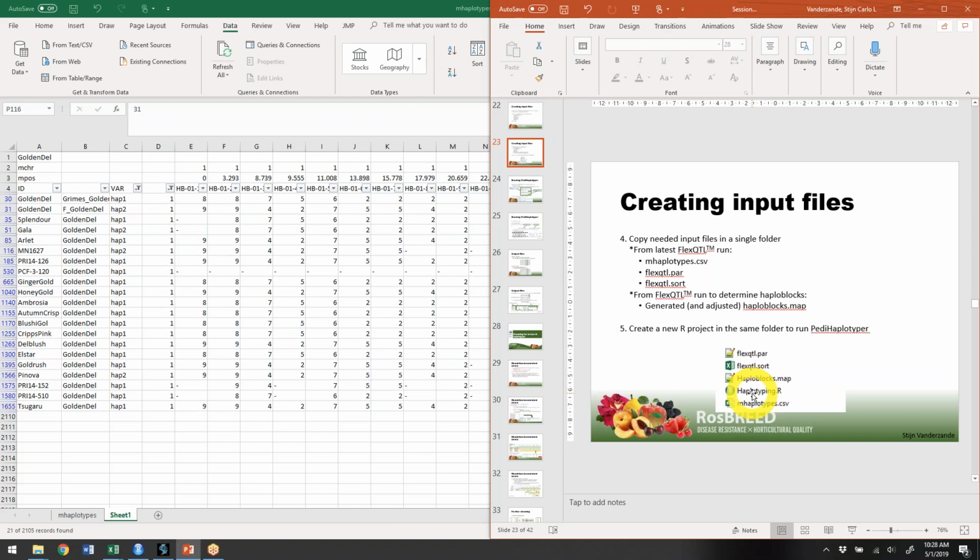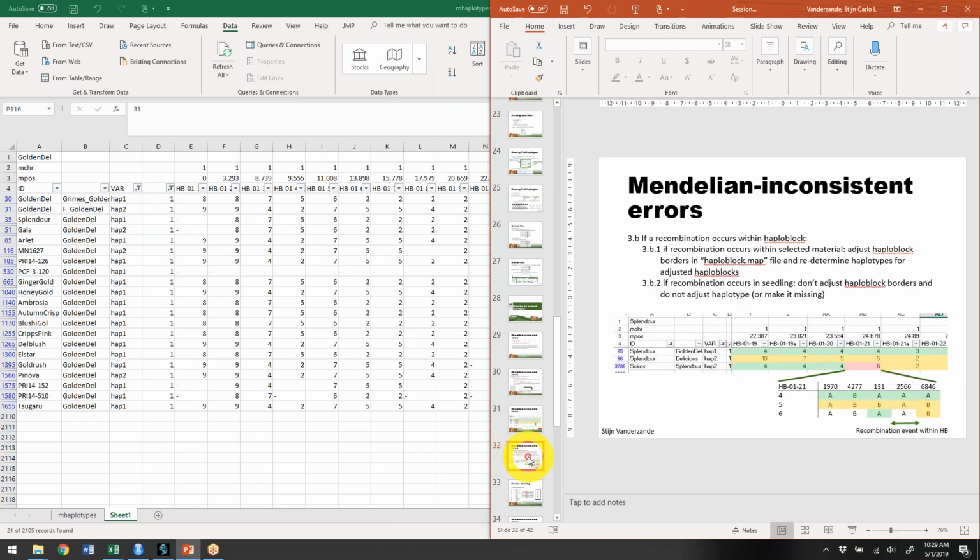I would only use the data from the new run, whereas I would keep my haplotype files as I've created here, with all my changes, for any marker that I'm confident that I solved. I think that, so let's see what time we have.